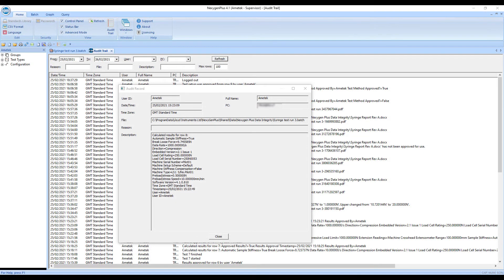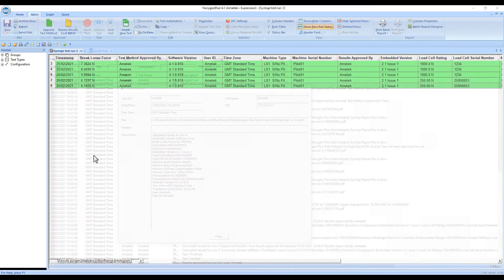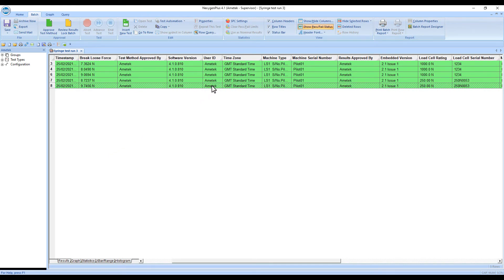The audit trail captures the calculated results and electronic signature. A reviewer can then review the test run and audit trail and approve using the electronic signature. The file is then approved and locked.